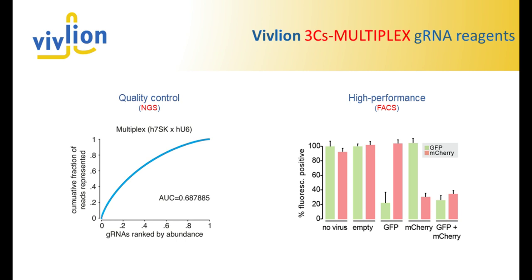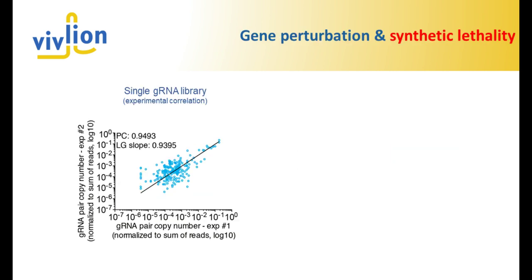So now this is of course only GFP and mCherry, but I'd also like to share with you another example that we have. Unfortunately, I will not be able to tell you what exactly the library or the experiment was. Suffice to say, this is an enrichment screen, so we use a fluorescent reporter that enables us to enrich for a certain phenotype.